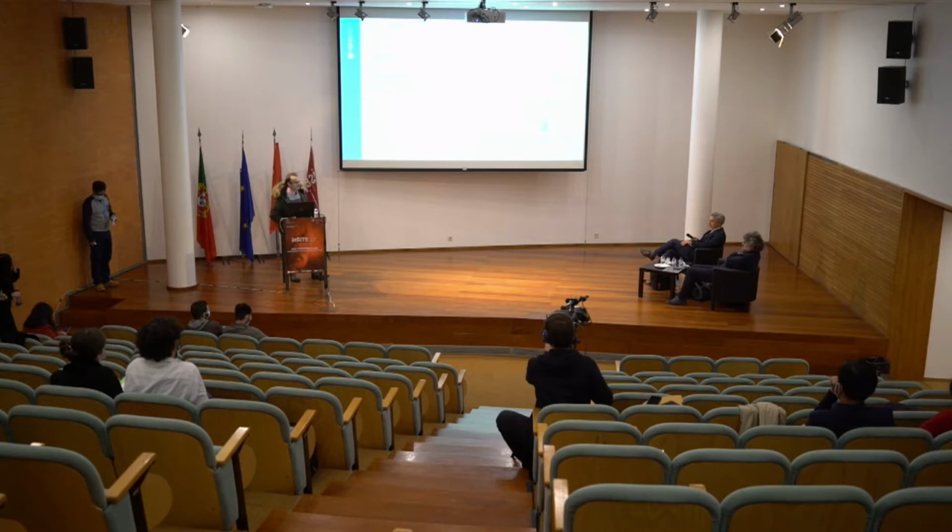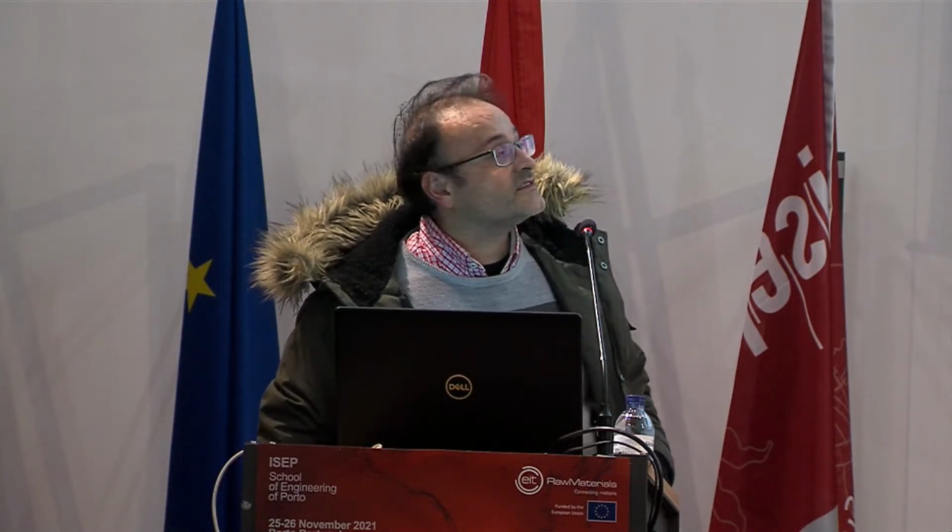Well, I don't know, but Professor Rasmus Bro, who is one of the founding fathers of chemometrics, published last week a paper saying that for complex samples, human interaction is always important. So at this stage in the development of this kind of models, as the data is very complex, it's important to have a chemometrics expert to validate the existing information.